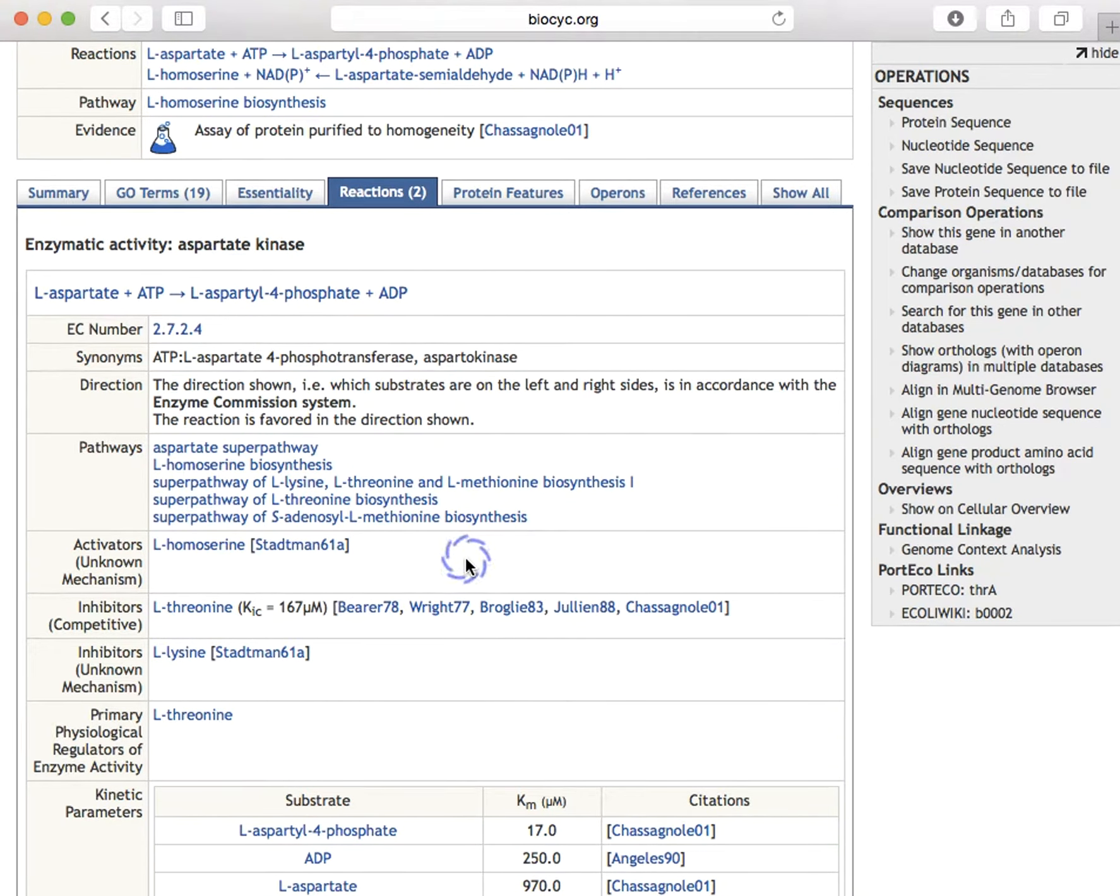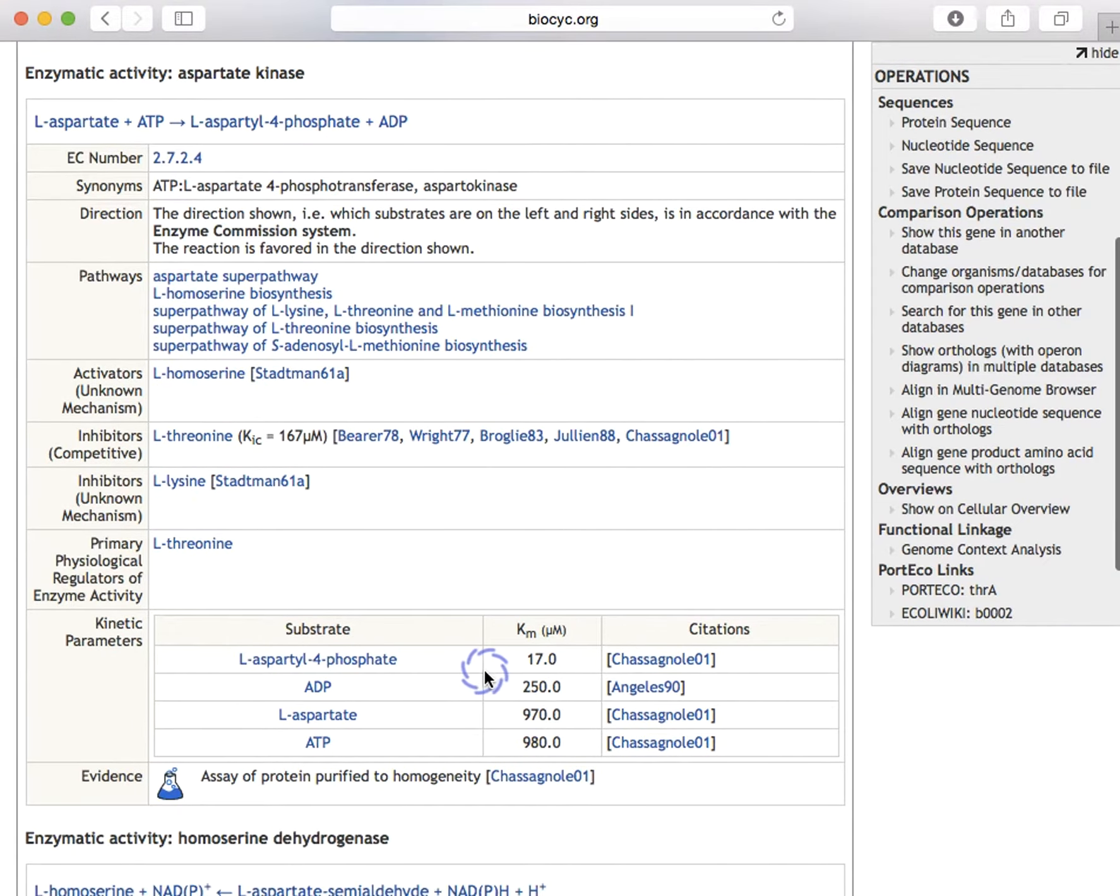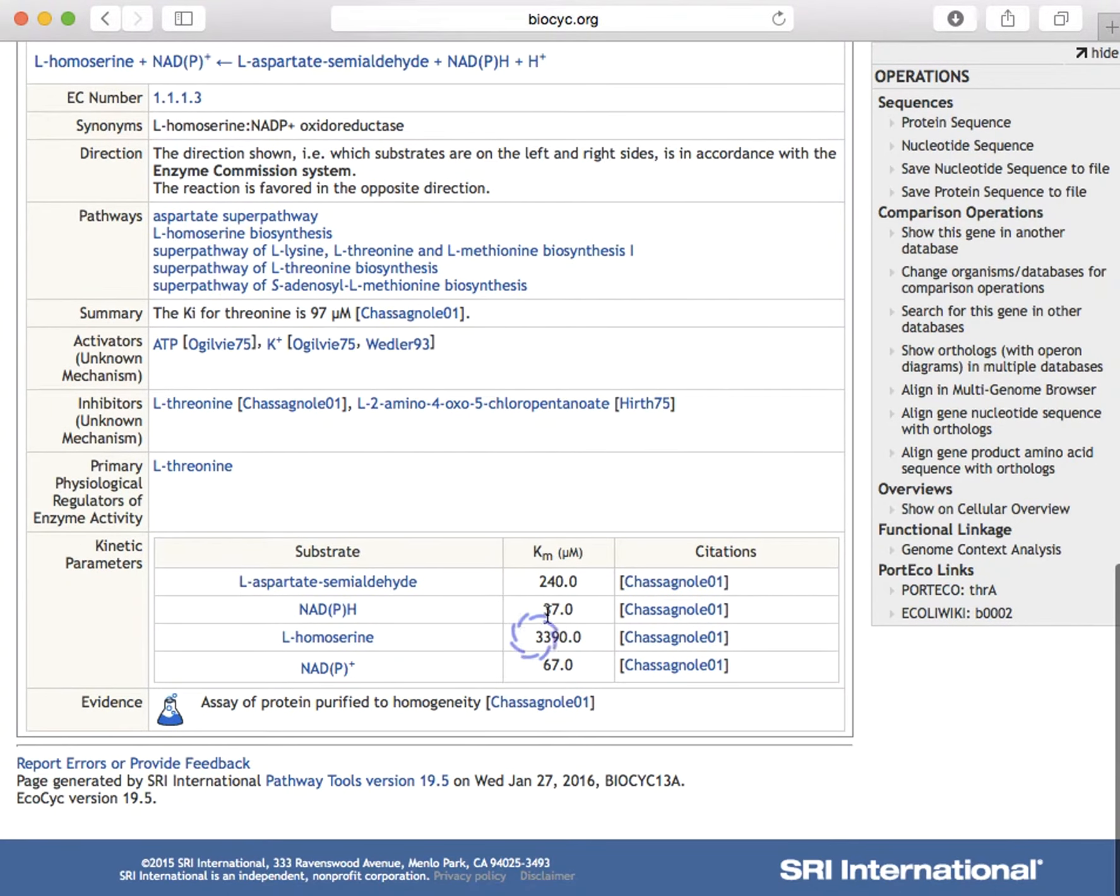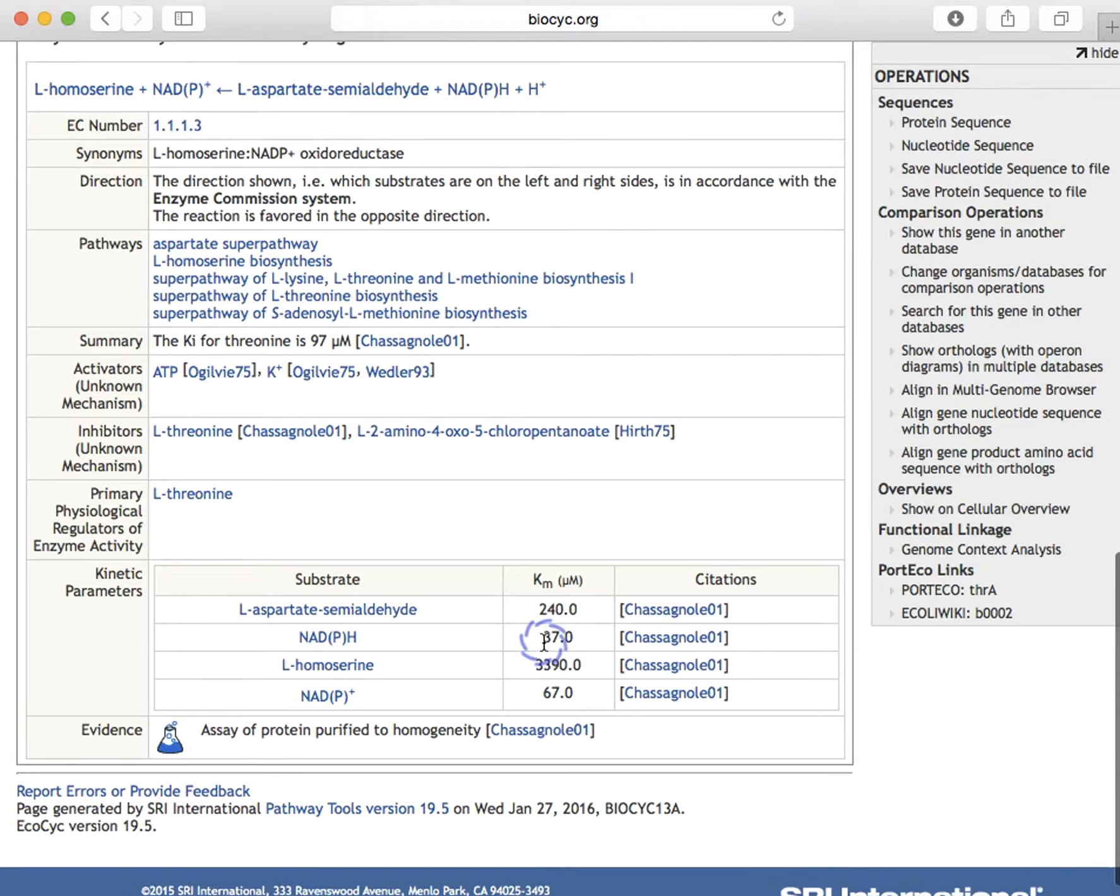Similarly, we list available kinetic parameters on a per-reaction basis for this reaction versus this reaction.